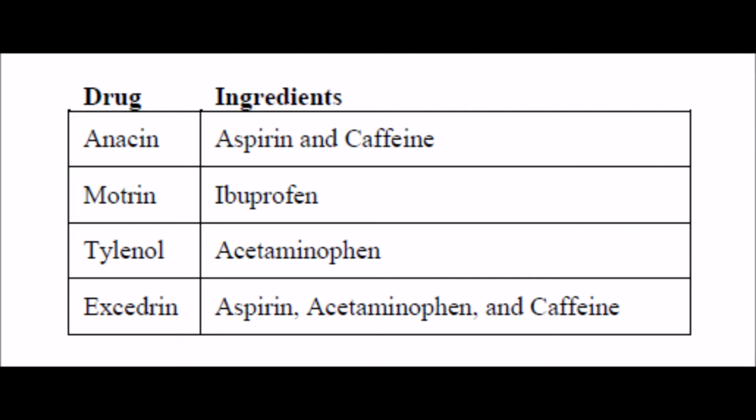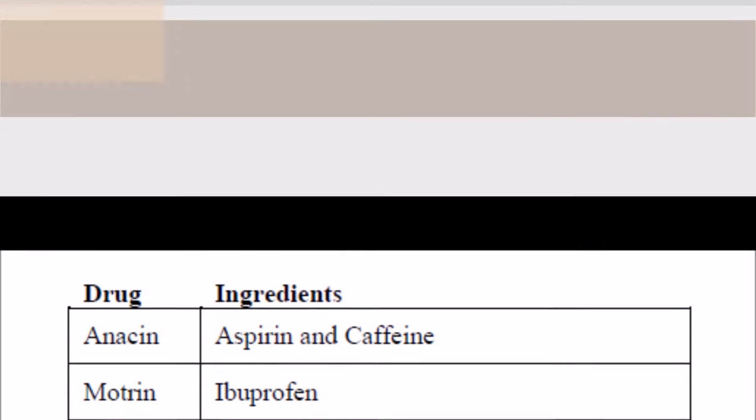TLC separates compounds based on how they interact with the stationary phase, a film built of polar molecules, and the mobile phase, a nonpolar organic solvent. The effect is what you can see here on this TLC plate.